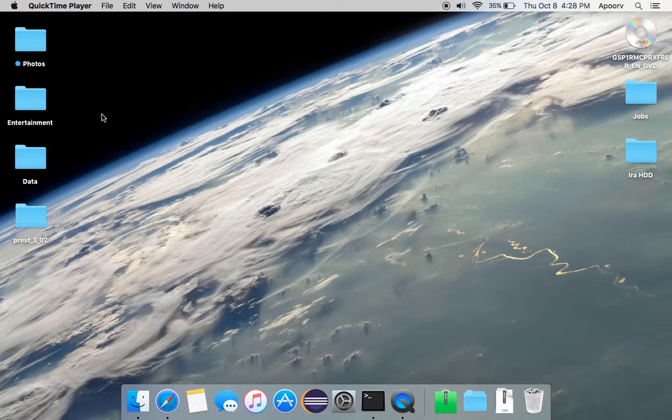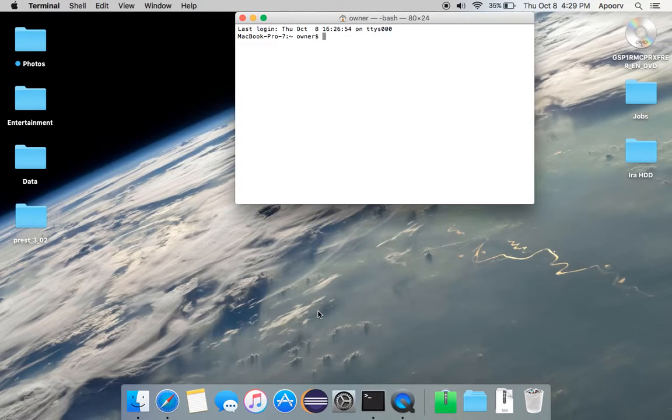The Prest tool is a medical tool which is used for genetic analysis of various blood samples which are taken as inputs. So let's start with the installation of the Prest tool. I have saved Prest on the desktop, and Prest is a console tool, so I just open the terminal and go to the desktop and inside the Prest folder.